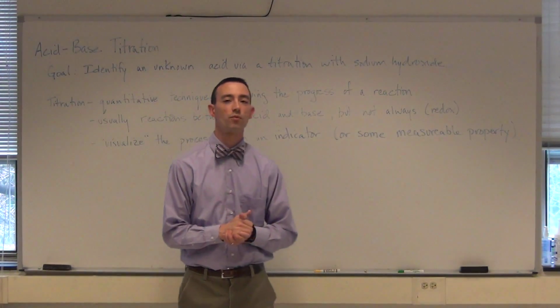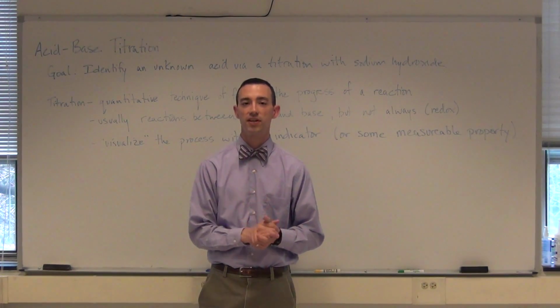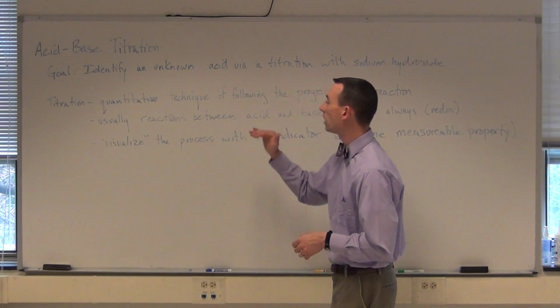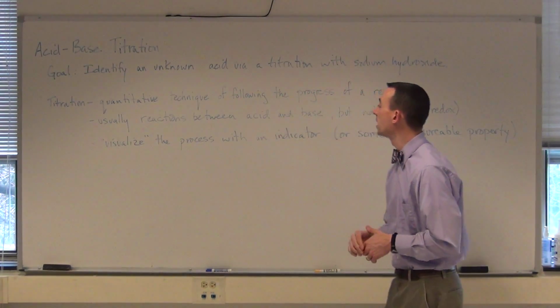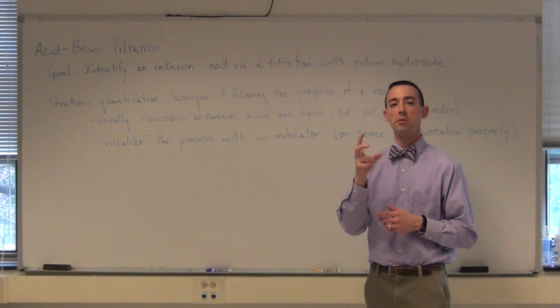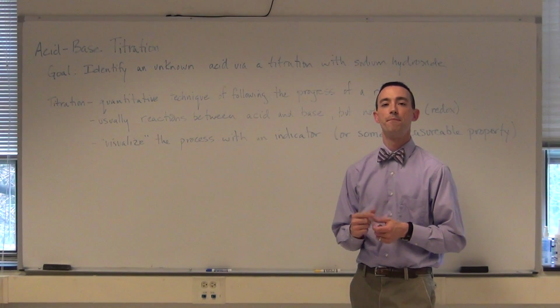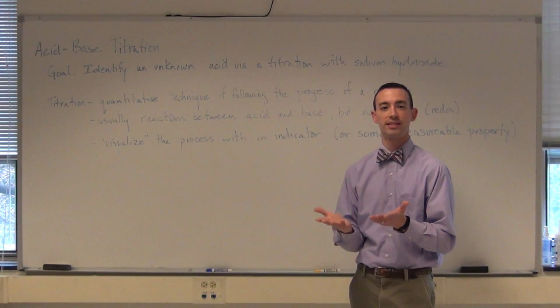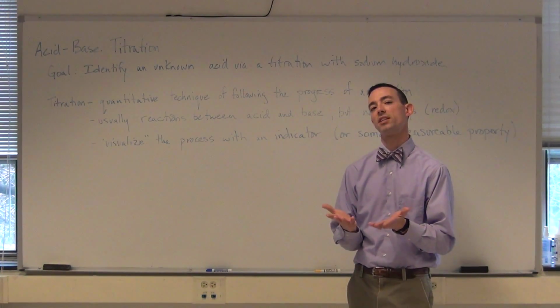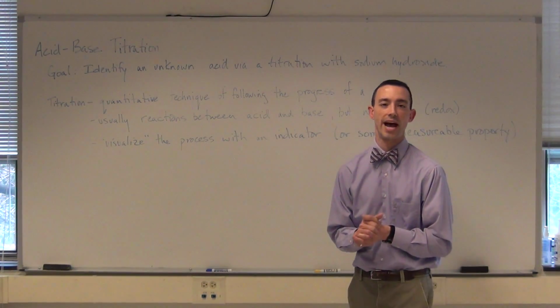If you've taken Chemistry 1, I'm certain that you have completed some titrations, and titrations are nothing more than a quantitative approach or technique to follow the progress of a reaction, to reveal some key point during your reaction, often the point when both reactants are present in equal quantities according to the ratio of the coefficients of your reaction.